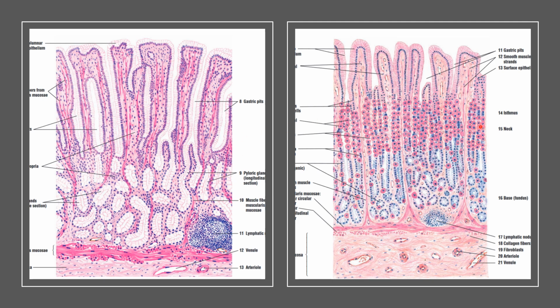Of course, here you can make out that prominent parietal cells will be there in case of fundus, but in the pylorus you will be having only light stained mucus secreting cells. So that's what you have to differentiate, fundus and pylorus. So now I have told about esophagus, pylorus of the stomach and fundus of the stomach. I told how to identify these slides. What are all the identification points you have to write?